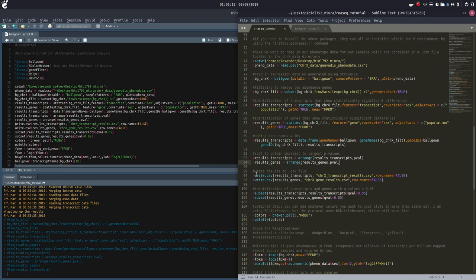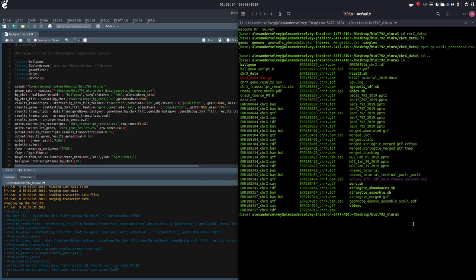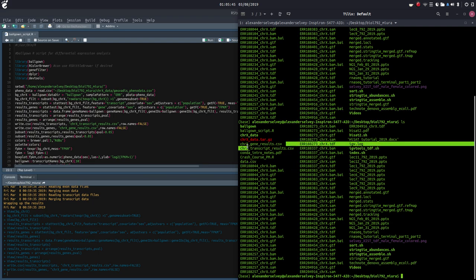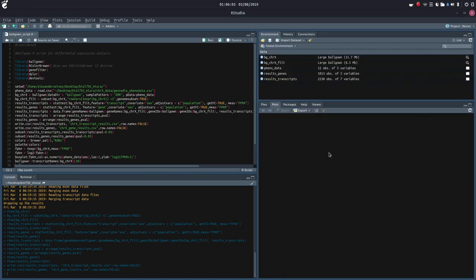Now we're going to write our results to CSV files. We're going to name them chromosome_X_transcript_results.csv and chromosome_X_gene_results.csv. Let's do that real quick, and then I'll show you that these have populated in here — chromosome_X_gene_results and chromosome_X_transcript_results.csv. So we have these two CSV files that we just wrote from our results_genes and results_transcripts environment variables.